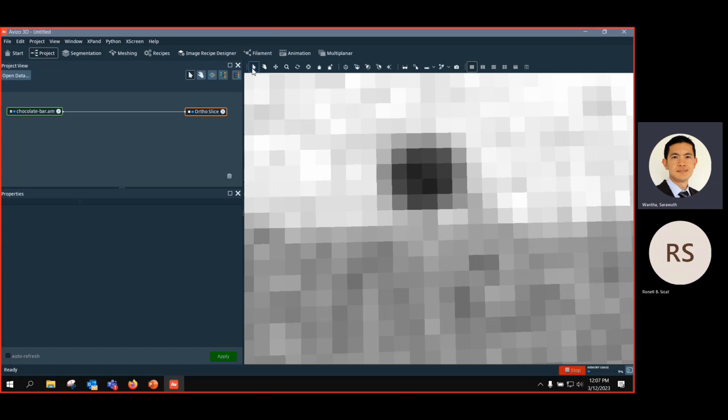And then change to this interact tool or arrow tool before you do picking, or probe tool here, sorry, probe. So then I will check click for update. Now I want to probe different intensity in different pixels. So if I go to very dark here and I shift and click, you can see that it shows the value at the bottom, 174. So this is the intensity of that pixel that I probe. So I go next to it, shift and click, and you can see the value of intensity change to 235.